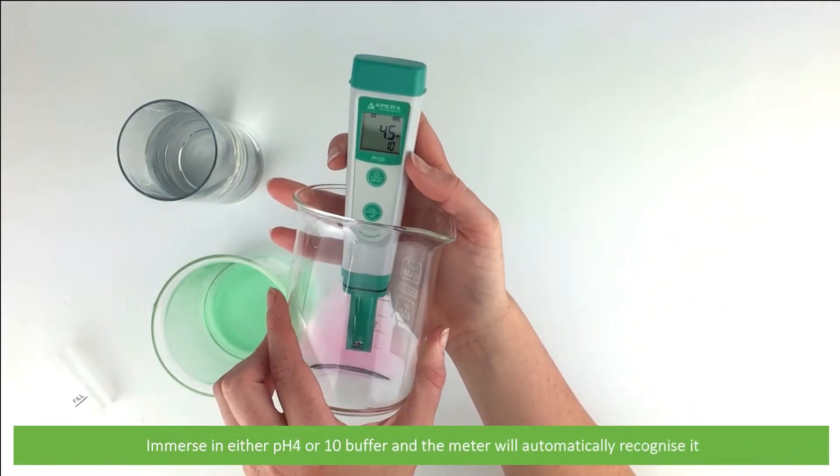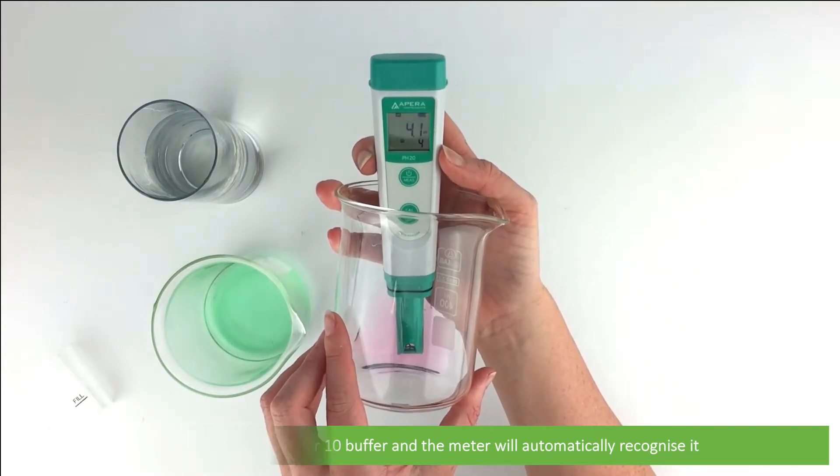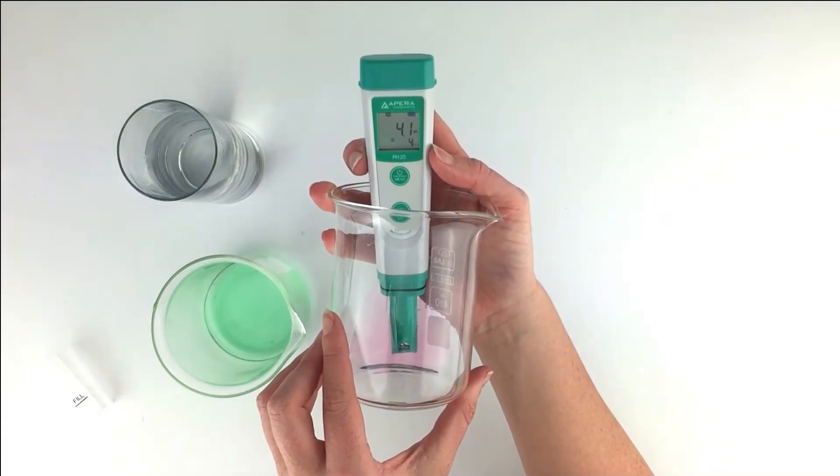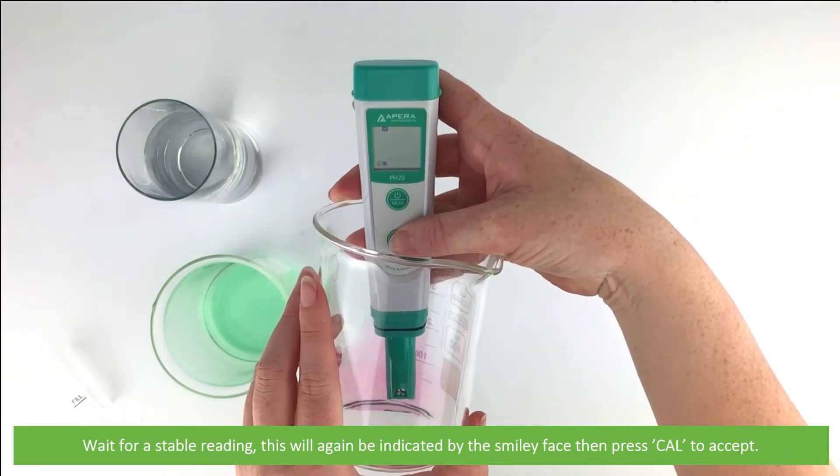Immerse the electrode in either pH4 or pH10 buffer and the meter will automatically recognize it. Wait for a stable reading — this will again be indicated by the smiley face — then press Cal to accept.